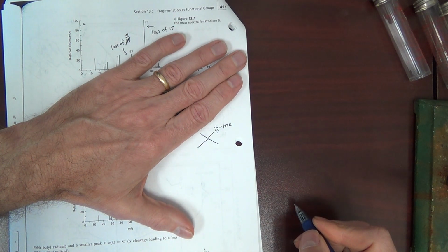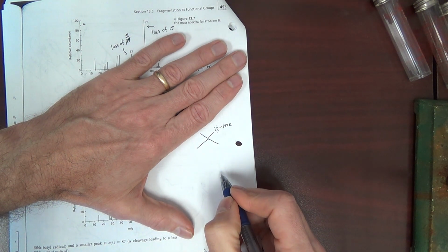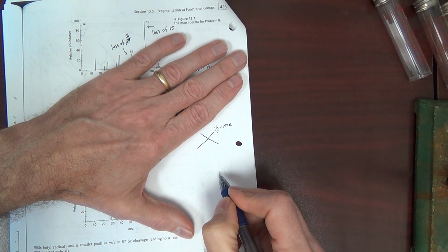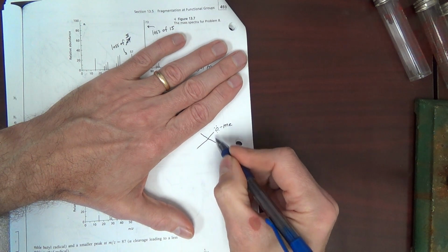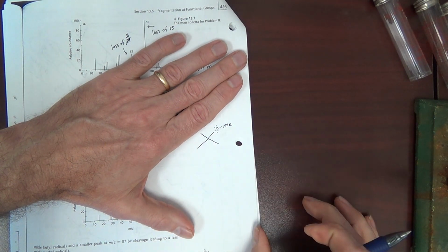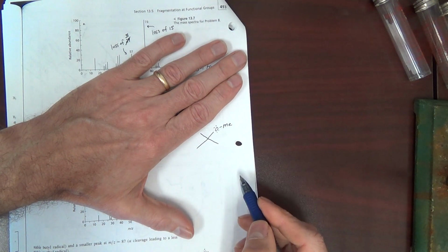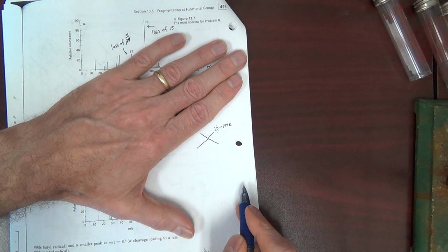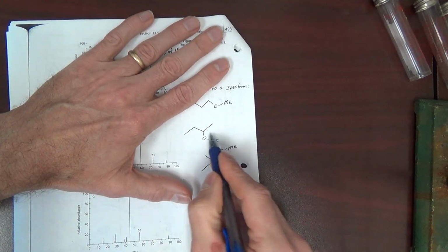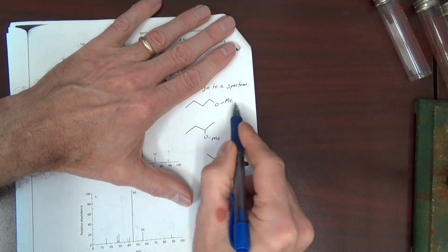All right. Draw that fragment, give it a mass. Do you expect any cleavage any other places? If so, draw that fragment and give that mass. So maybe this has 2 or 3 masses that you predict. Write those down. Do it again for here. Write down the masses of the fragments that you predict.